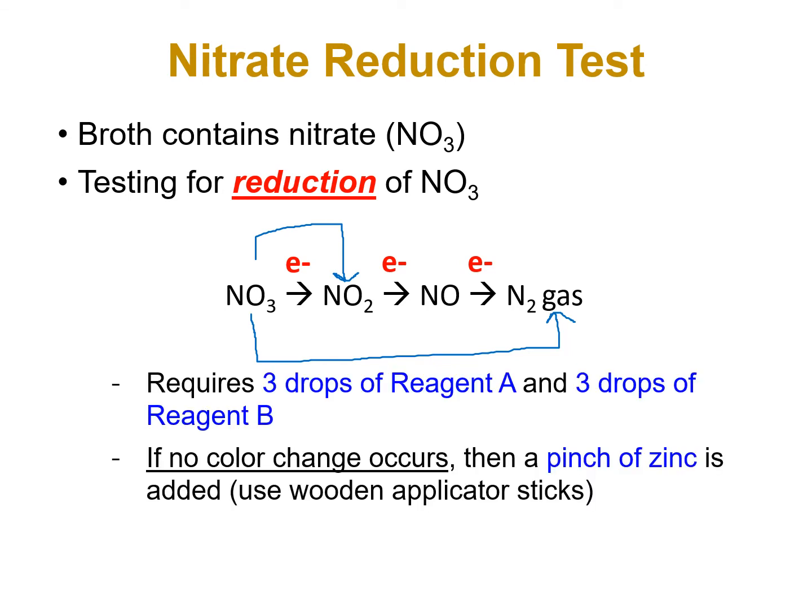So usually what we do, right, we get this broth, which contains nitrate, of course. Your broth has to contain nitrate. And then you go ahead and you inoculate the broth with your bacteria. You stick it in the incubator for a couple of days.